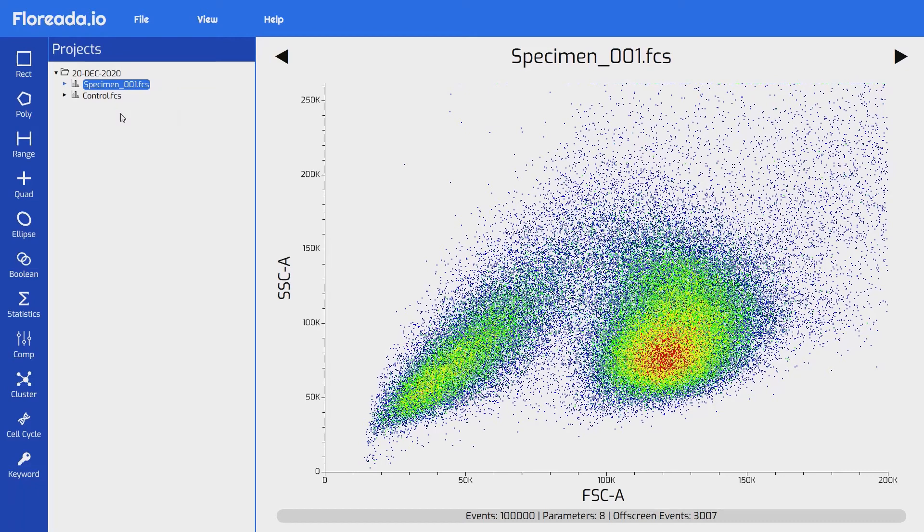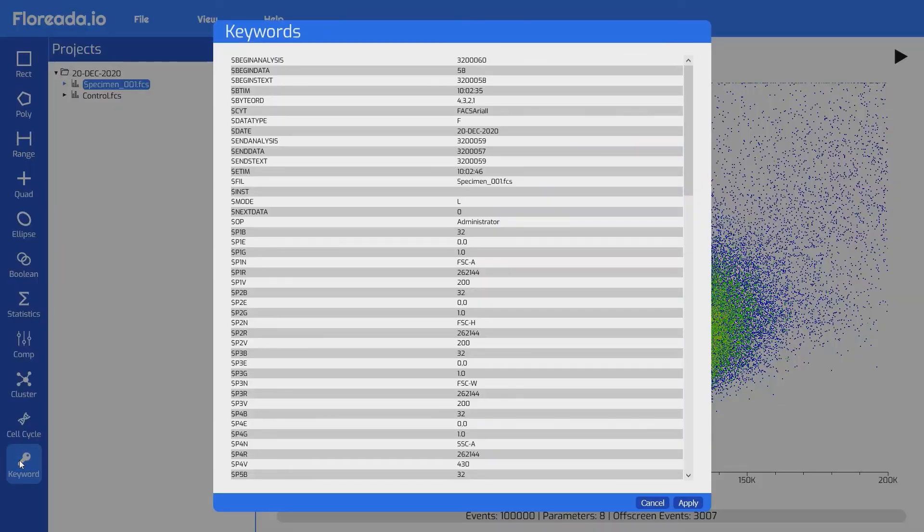Lastly, if you'd like to see the keywords that are contained within your FCS file, you can select the file that you'd like to see and then click the keywords option. That will display a list of all keywords in the file as well as their values.